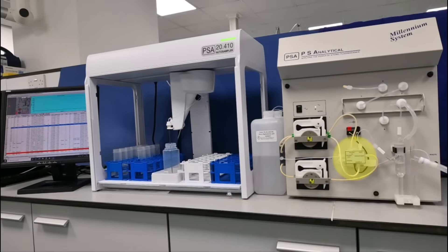An electronically controlled switching valve alternates between blank and sample solutions, and the gas-liquid separator separates and delivers the gas cell products to the detector where subsequent spectroscopic determination can take place. The gas-liquid separator has been designed to minimize moisture carryover, which would otherwise affect the performance of the system.